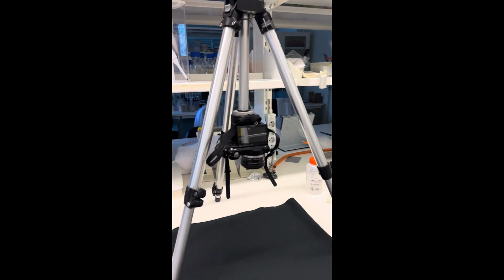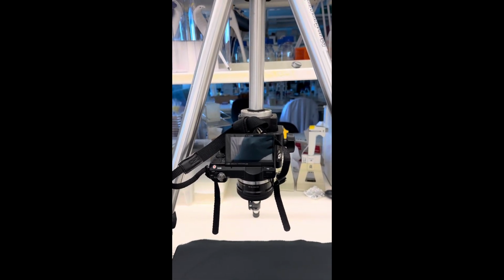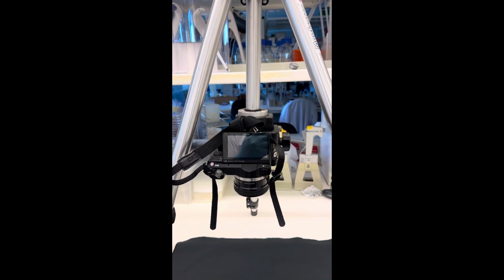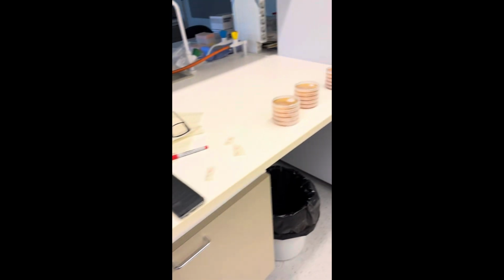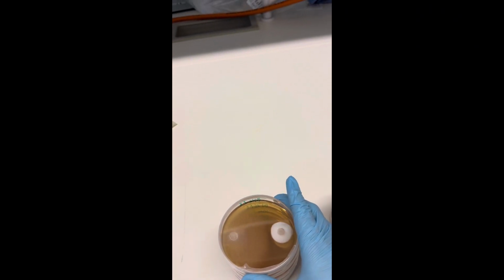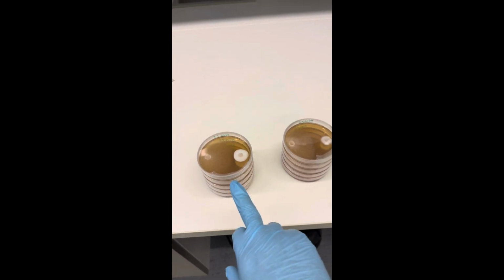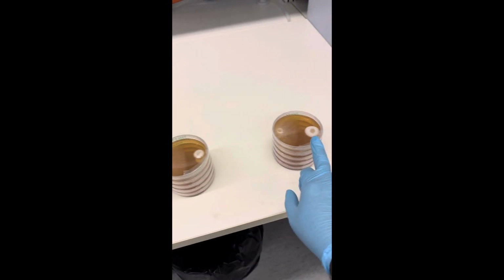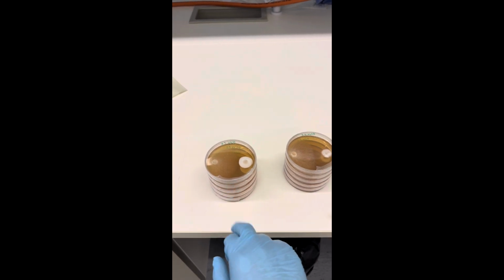I have already installed the camera here on the stand because I need to take snaps of the plates, as I have to record them for publication purposes. First I can show you there are 3 different species, 1, 2 and 3, and each of them has been replicated 5 times for each treatment.